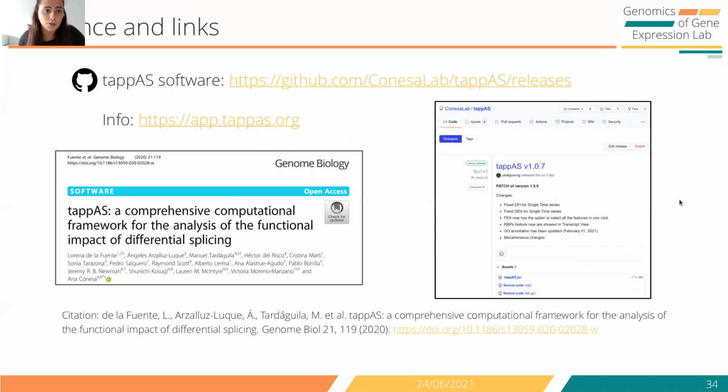Since time is limited in the presentation, I'm not going to say much more. If you're interested in using TappAS, you can go to our GitHub site and you will be able to download it there. There's more info and documentation both on the GitHub page and on the proper website for TappAS. And if you are interested in seeing how you can use TappAS to generate interesting results, how to interpret them, or how to get some ideas, there's a paper that was published last year where we demonstrate fully the application, and you can also go into the methods and really understand how the analyses are performed.